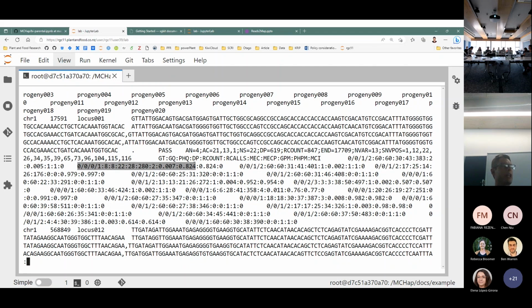So a lot of this is about trying to make reasonable assumptions about your population. The main problem we're dealing with here is that when you start creating haplotype alleles, you have so many possible haplotypes, and so you're trying to refine that parameter space down to as few haplotypes as is reasonable. The maths behind it for biallelic SNPs is quite simple. If you have 10 SNPs in a haplotype window, then you have 2 to the power of 10 possible haplotypes. I think that's 1,024 or something, I can't remember. But it's exponential complexity, and so it just gets absolutely massive very quickly.